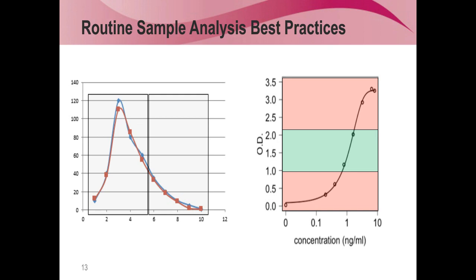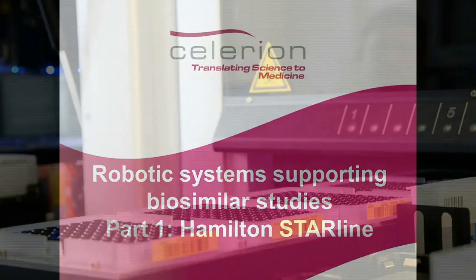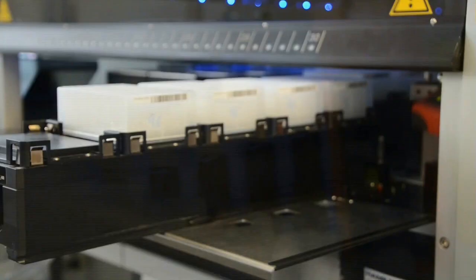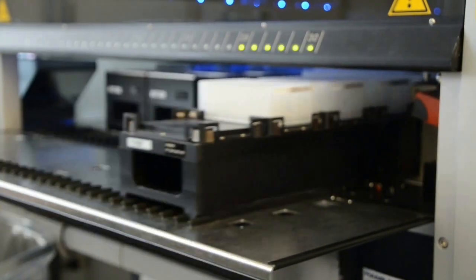But I think the biggest contributor to variance here is the human factor in pipetting. And we are in Switzerland, where manpower is very expensive, so we deal with this by basically getting rid of the human factor. And it should play now, the video of our instruments where we have automated lots of the assays.